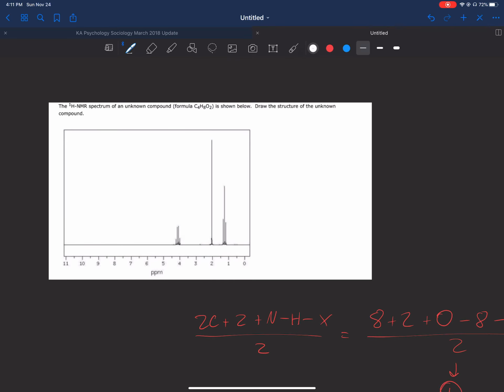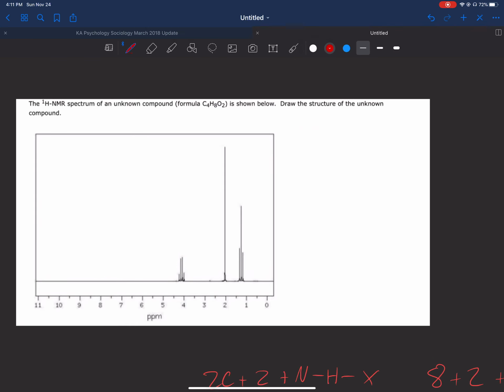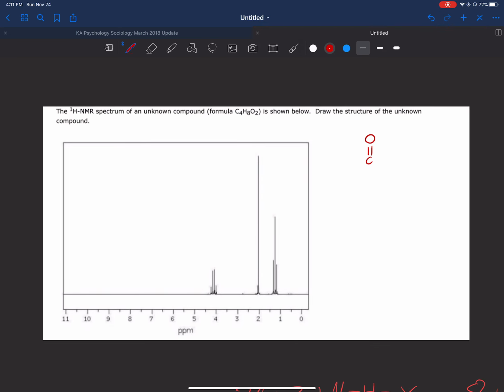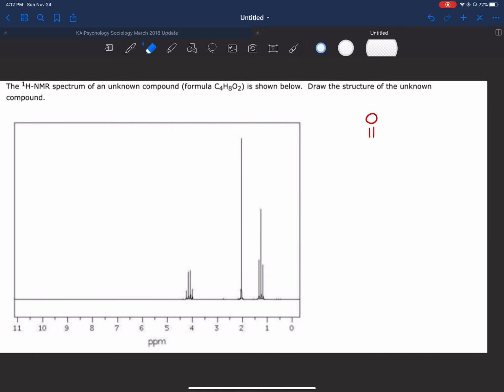So a good thing to do when you have an IHD of 1 and you have oxygens is to draw a carbonyl like this. Start your entire structure based around the carbonyl. And here's the carbon here. Because chances are it will be that, so it will help you. Not always, right? But it's a safe bet to start out with. So that accounts for one of our oxygens and one of our carbons. So we're going to leave that for now.